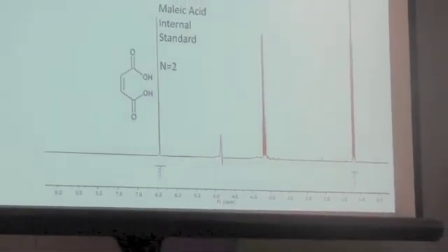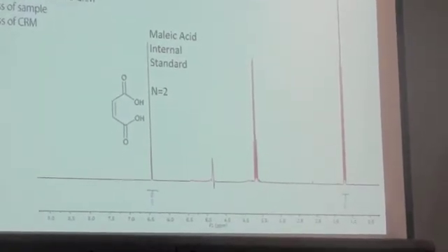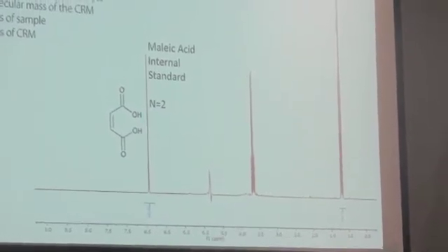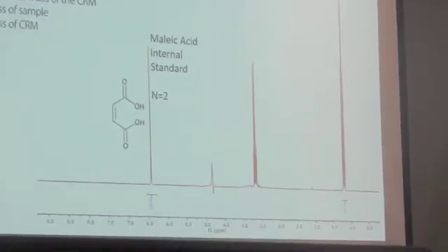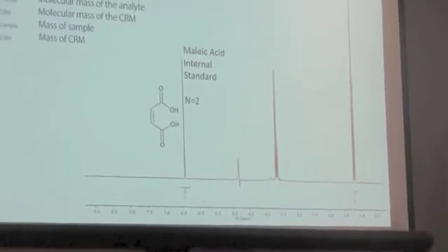So I quantify all the volatiles, like ethanol and acetic acid and methanol and things like that, if they're in there, on the as-is sample. And then I'll freeze dry the sample. The volatiles are all going to pop out, but everything that was not volatile, like leftover sugars, is still there.